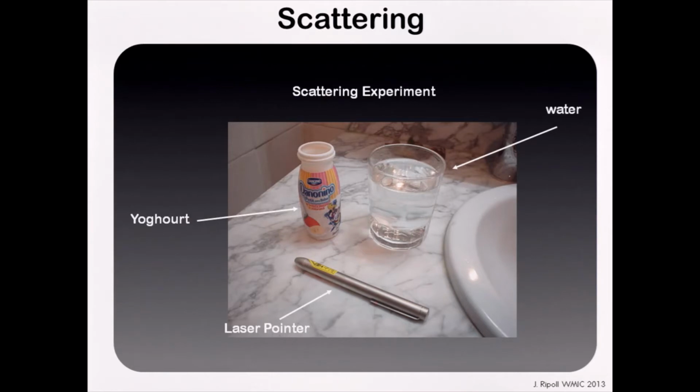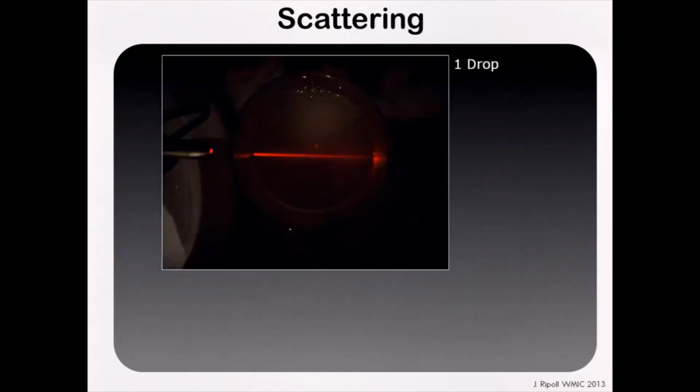So first, if you don't put any drops of fat, you wouldn't see the laser beam, right? That's something you should all have in mind. If there's no scattering, you wouldn't see the laser beam because we're looking at 90 degrees. Now, if there's only a little, then you clearly see that it exponentially decreases as it goes inside. This is Beer's law. Probably some of you are familiar with it. But the important thing here is that light doesn't lose its original direction. So we say in this case that light propagates ballistically.